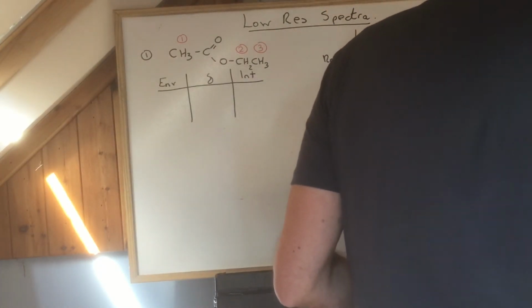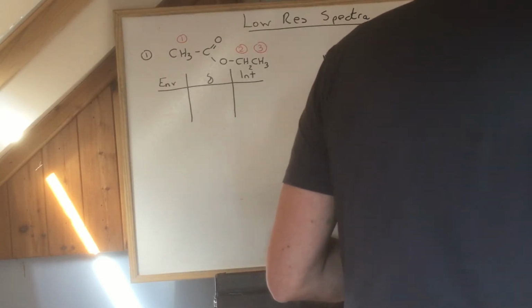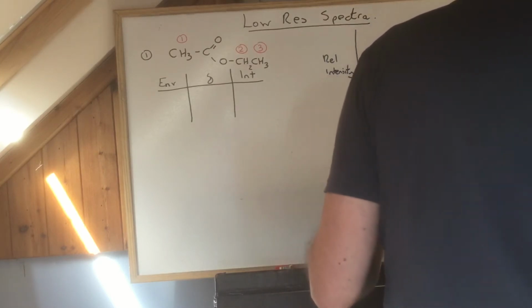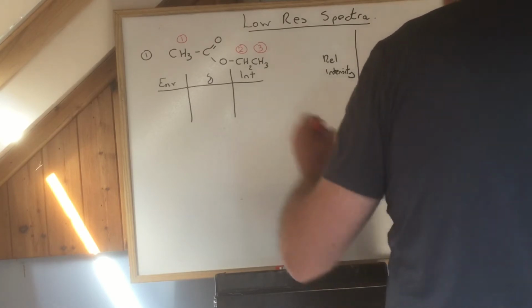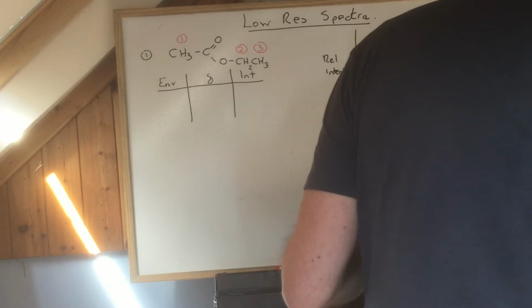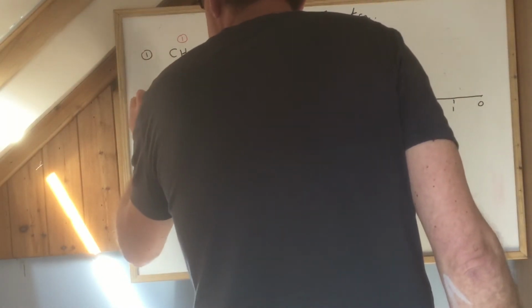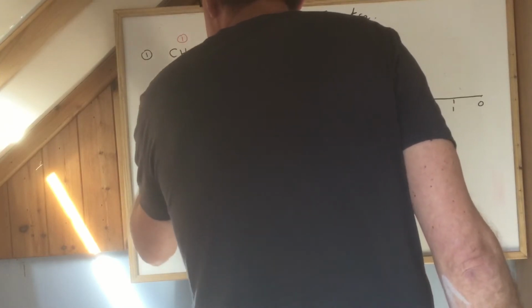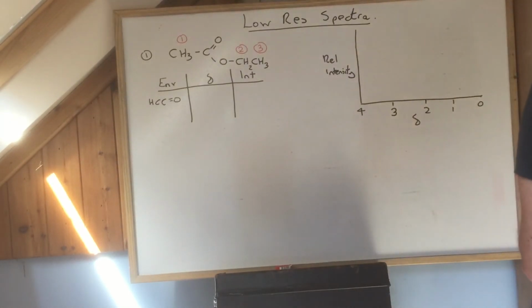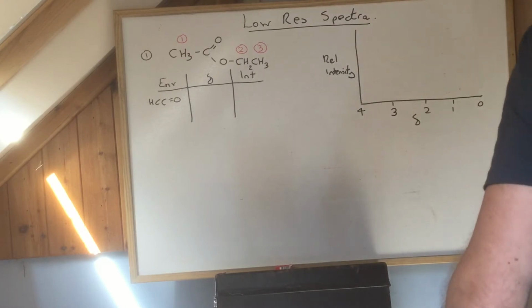So, bearing that in mind, going from left to right, here we are. So if I go from these 3 here, chemical shift values and all of that, we're talking H joined to a C, which is joined to another C, double bond O. No doubt, if you look at your chemical shift table, that there is H, I just said it, between 2 to 3.